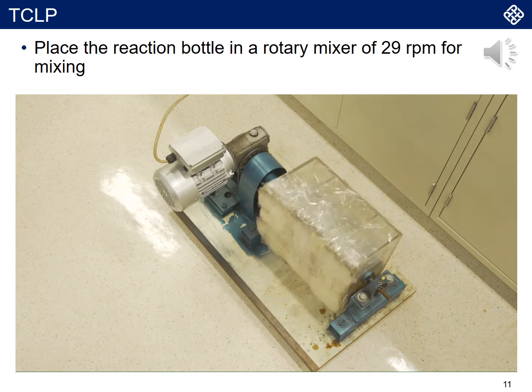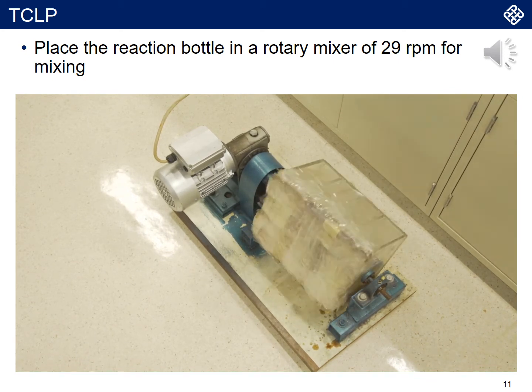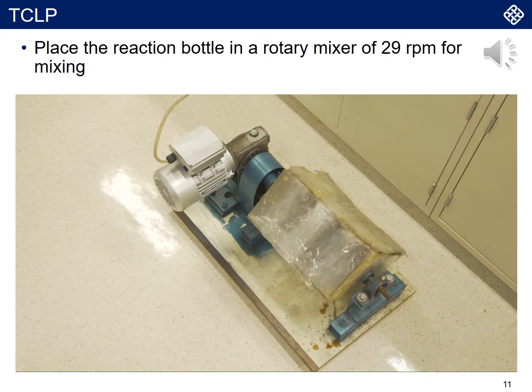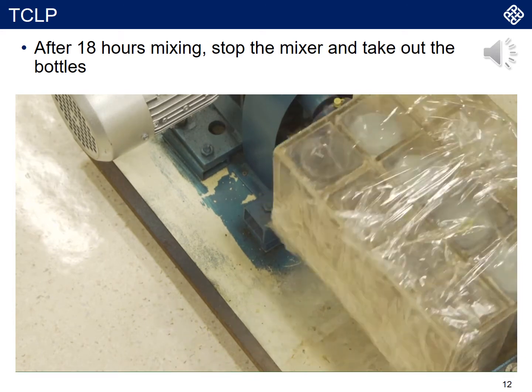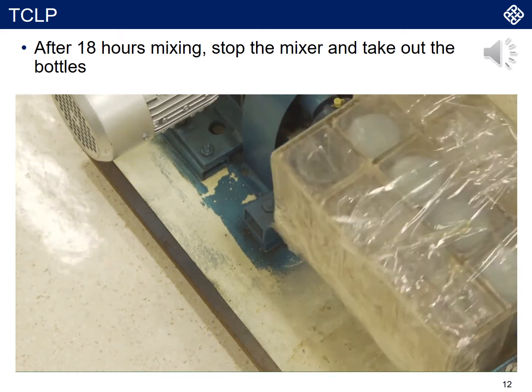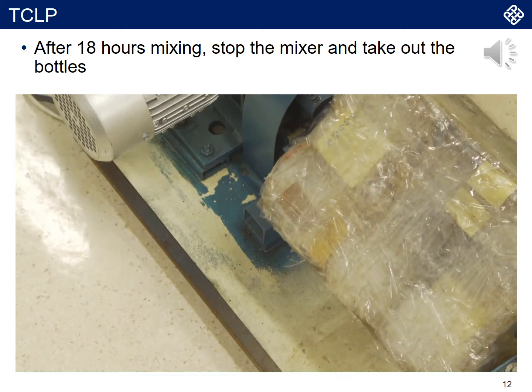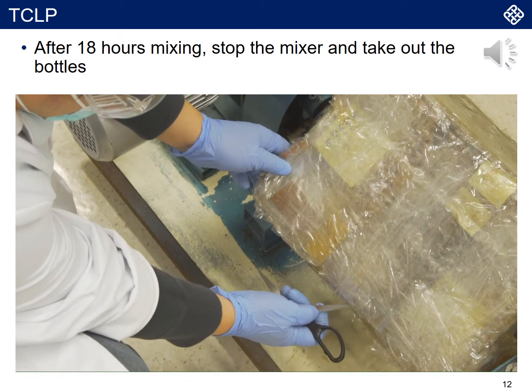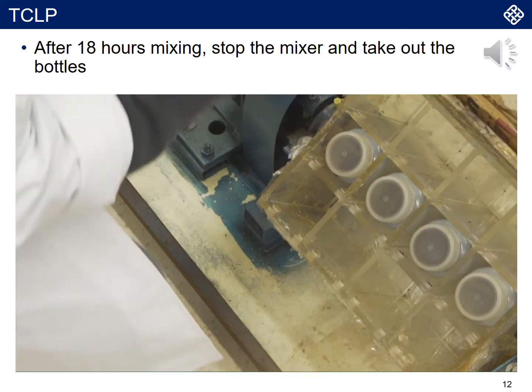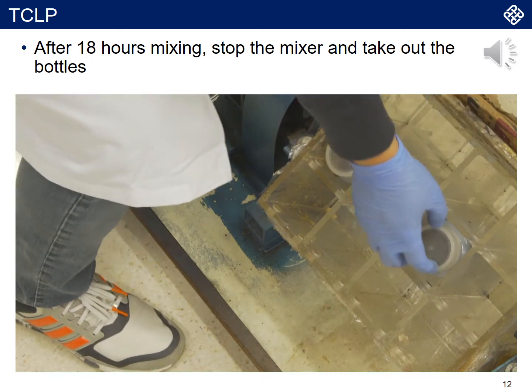The detail of how much time you need can be checked in the handout. Okay, the total mixing hours. Now we show you the answer, which is 18 hours. And also, the whole procedure is very much straightforward as we mentioned. You just take it out.